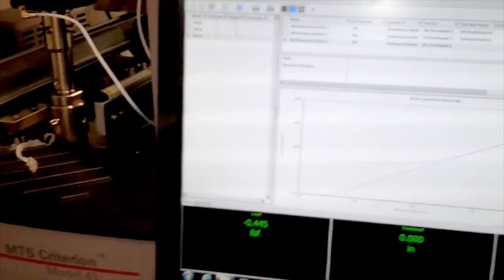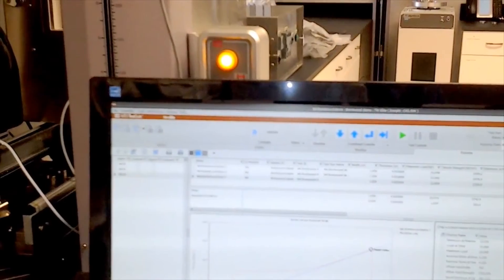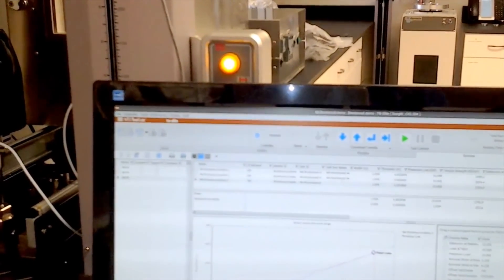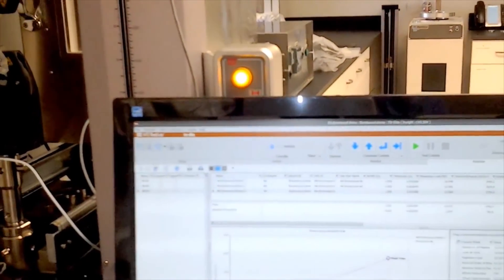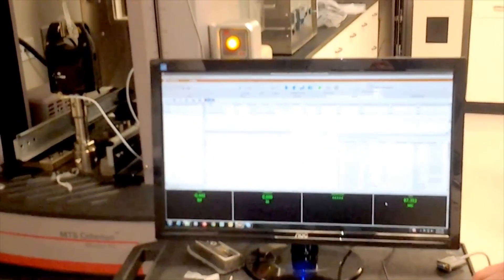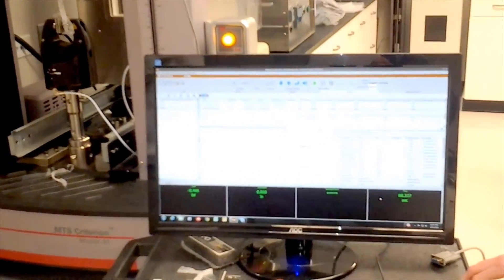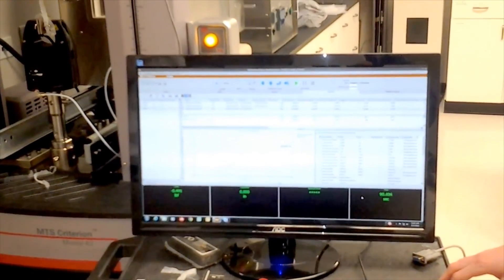How much force did it take to make it break? Roughly, the stress at break is 3750 PSI, and the strain at break was about 600%. There you have it expressed in both pounds per square inch and percent. That's ASTM D882.